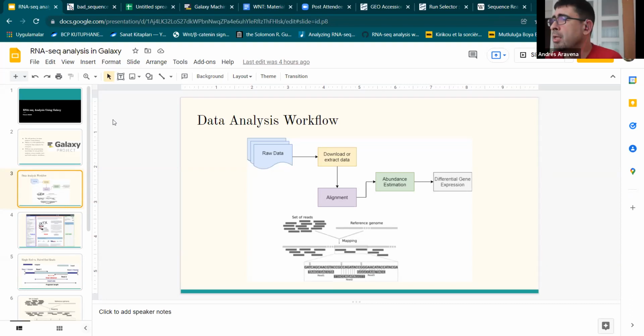In the literature of the topic, people describe genes as targets and not transcripts. Even if you wanted, we don't have the info at that level. But you can imagine, okay, a PhD thesis for someone. Yeah, he gave us the idea. That's a good question.